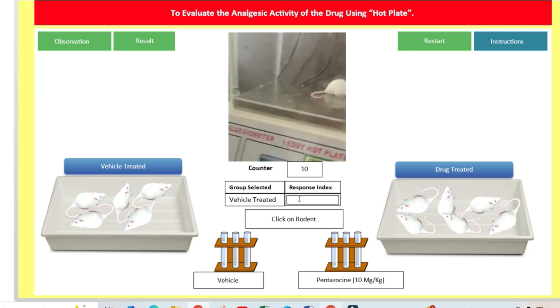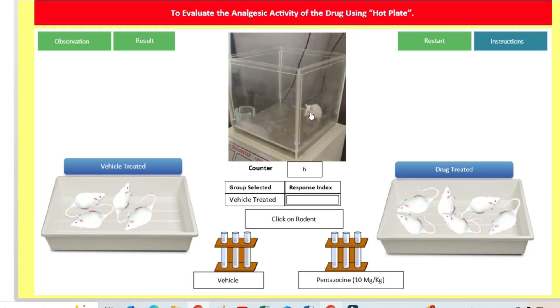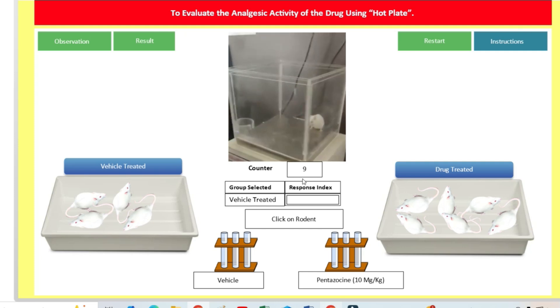When it starts licking its forelimbs, that is when we have to click and record the time. Response time: 10 seconds. We will click to the next animal and carefully check when it starts licking its paws. Generally, while we are doing the experiment on live animals, we can easily take them out from this environment.